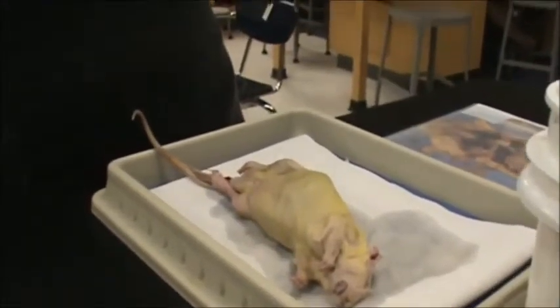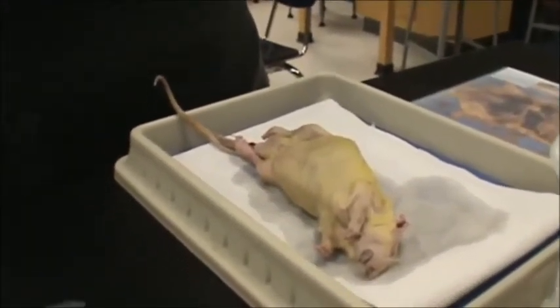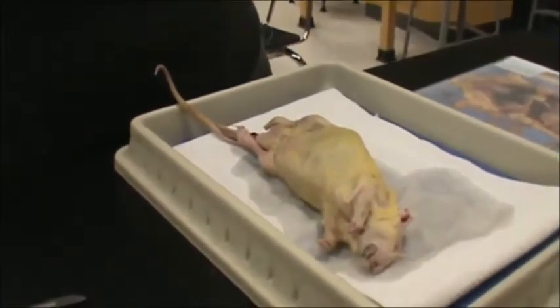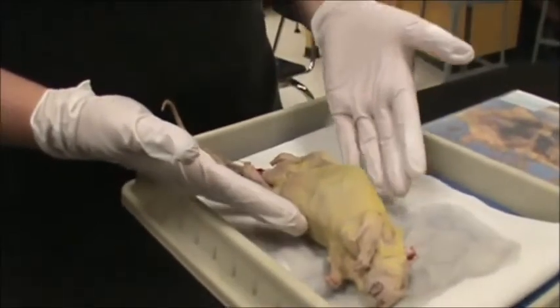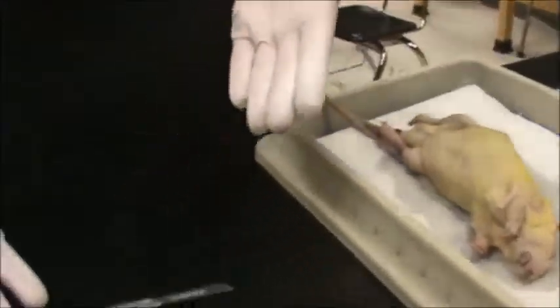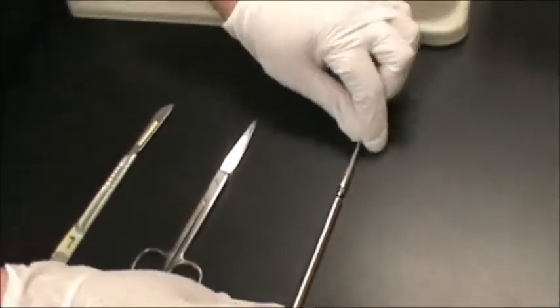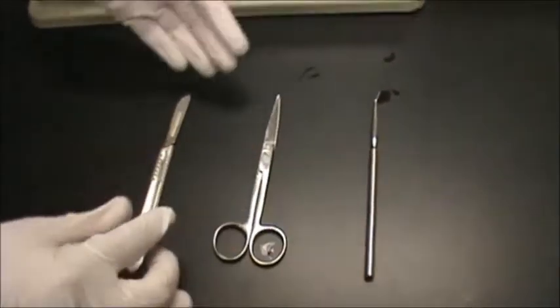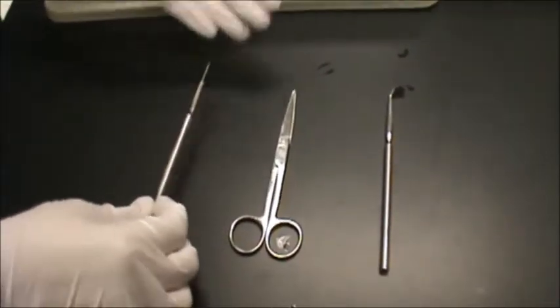Hello, my name is Mrs. Pizzorno, and this is a rat dissection tutorial for a biology class in high school. Today we have a male rat, and right here we have three instruments. We have our first is our probe, second is our scissors, and our third is our scalpel.